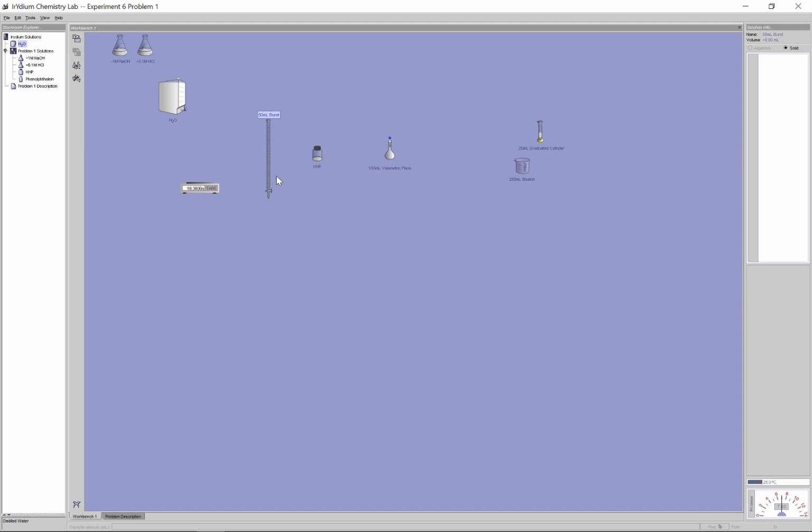Usually what I tell people is just fill the burette here something more than half. What I don't want is, I don't want it to be running low on the burette and I haven't still finished the titration. Anytime I need to reload the burette sort of mid-trial, that's going to introduce error. I just want to make sure there's enough volume in the burette so that for one trial that I'm testing, there already is enough base to actually do the titration. So usually I say more than half.